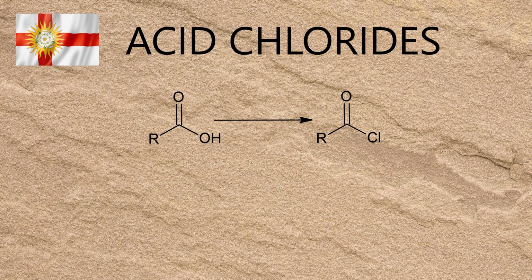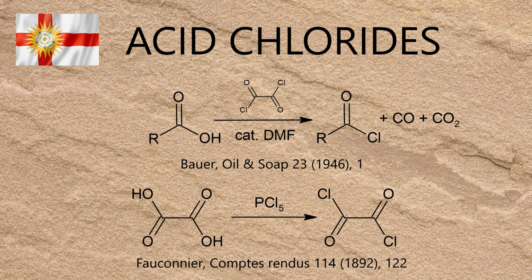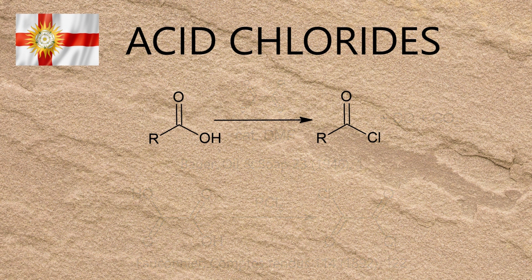Another method involves using oxalyl chloride, which is similarly hard to find in homebrew. Homebrewing it requires phosphorus pentachloride, which is pretty nasty in its own right and is also a chemical weapons precursor. And preparing phosphorus pentachloride requires chlorine gas and red phosphorus, the latter of which is highly restricted due to its use in meth manufacturing. A much more accessible and less hazardous method was published in 1979 by Venkataraman and Wagle.